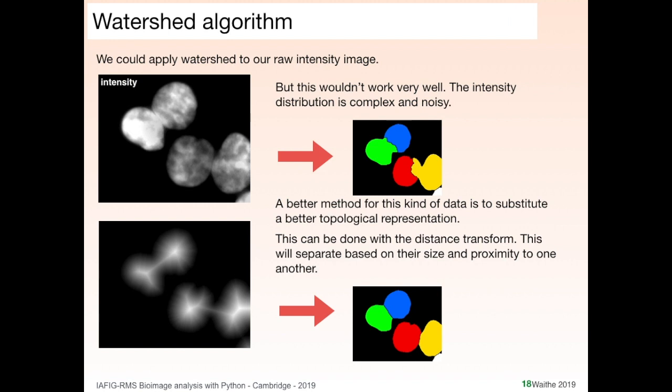Okay, so this might seem like an extra step, but it's so common to see watershed applied in this way. But actually, I want you to know that watershed can be applied to raw intensities as well. But this is commonly what you end up doing. So the watershed is the process of incrementally flood filling your image based on the intensity or the distance. The kind of metric you use for deciding what to base your watershed on is independent of the watershed algorithm.